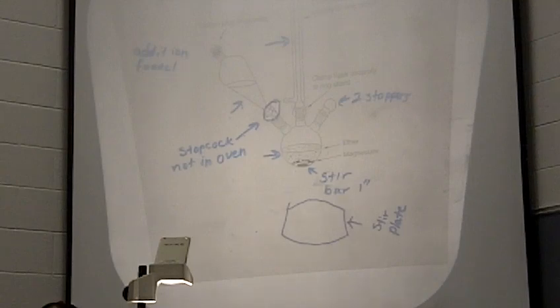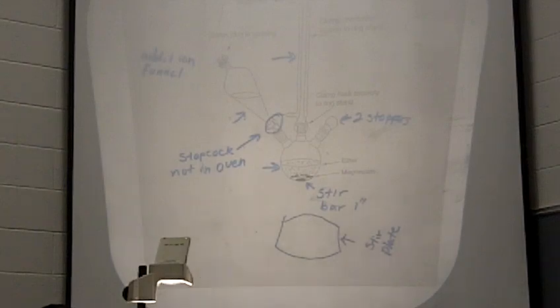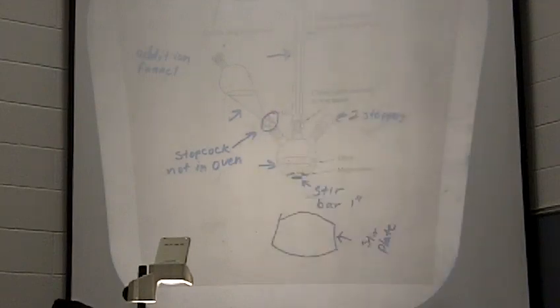And what you'll see is you'll start getting cloudy and you'll start having bubbling on your magnesium. That's a sign that a reaction has started, so then you want to keep adding that alkyl bromide to keep that reaction going, okay? So it's going to be a fine line of adding it slow enough that it's not too fast, but adding it fast enough that you keep the reaction going. You want to keep a nice reflux going in that reaction, all right? Now remember, this whole time we are not stirring. During the Grignard reagent formation, there is no stirring, okay?